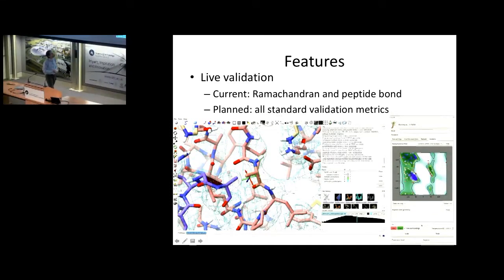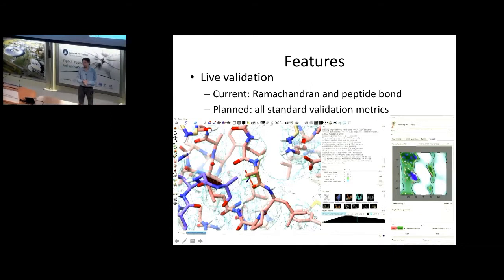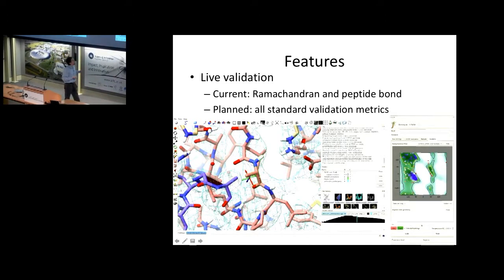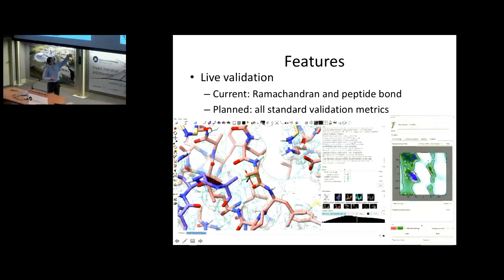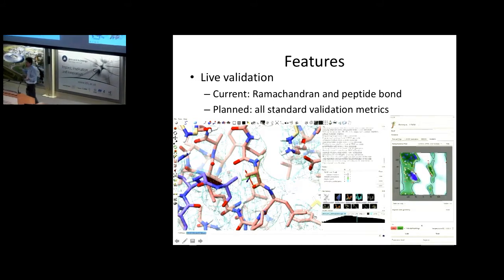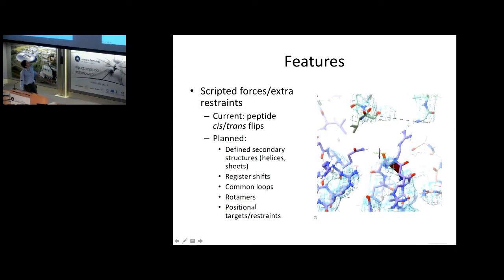So this was my first example of this, but the code that I've used to do that is I've split out and been talking to the folks behind MolProbity to turn this into essentially a live version of most of the standard MolProbity validation metrics. So your rotamer outliers, if you're working with RNA, the suiteness score, and then your CaBLAM scoring system, specifically for low resolution data, that follows the C-alpha trace and predicts whether you're actually in a realistic conformation or not. Eventually, all of those things should be similar live visualizations.